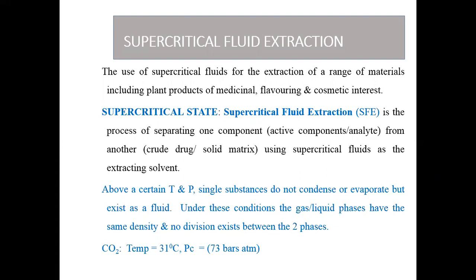Above a certain temperature and pressure, single substances do not condense or evaporate but exist as a fluid. Under this condition, the gas and liquid phases have the same density and no division exists between the two phases.